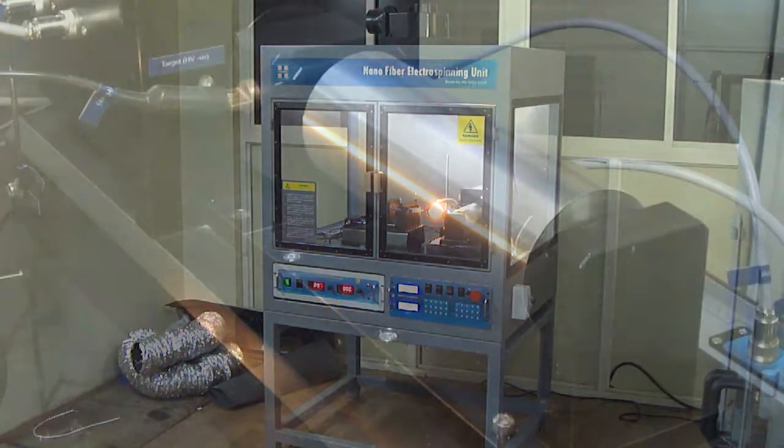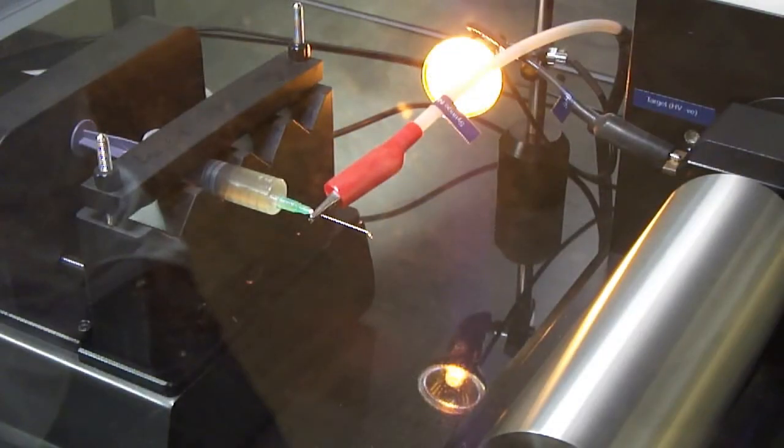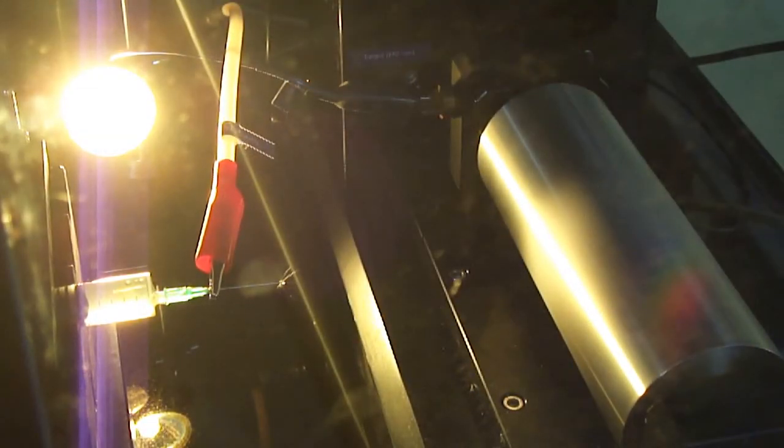When a sufficiently high voltage is applied to a liquid droplet, the body of the liquid becomes charged, and electrostatic repulsion counteracts the surface tension, and the droplet is stretched. At a critical point a stream of liquid erupts from the surface.